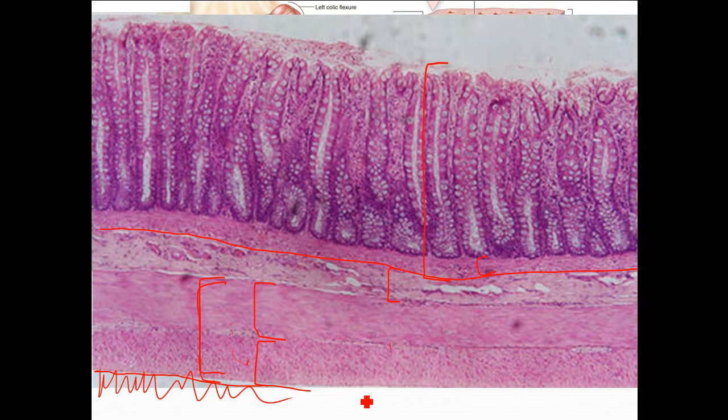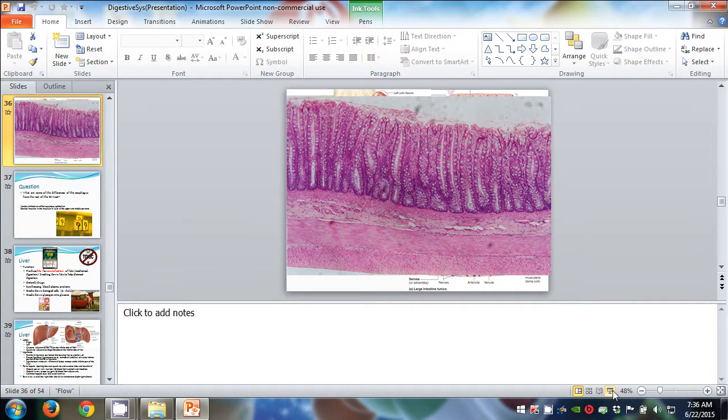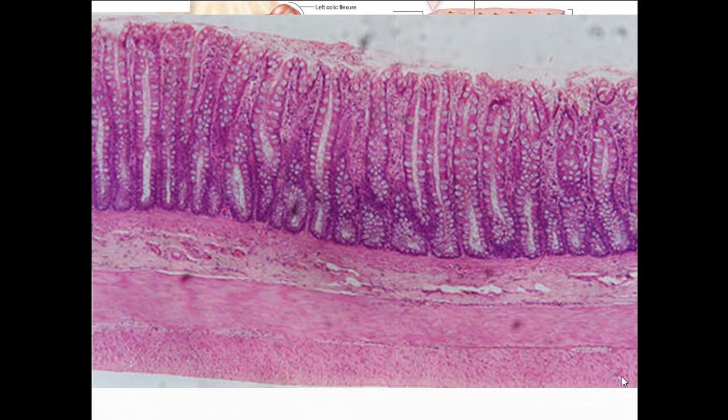Where would the lamina propria be? It's underneath the epithelium. So all this that's here is lamina propria. It doesn't have the goblet cells like in the picture; it would just be empty of that. All these structures that you don't see stained over here are goblet cells. No, not inside the lamina propria, just the epithelium.